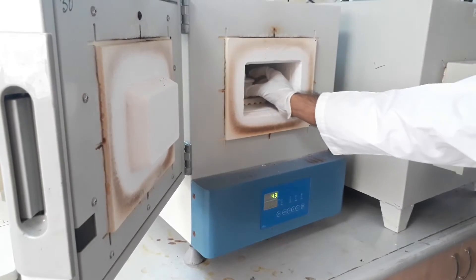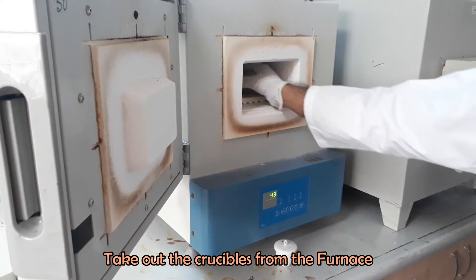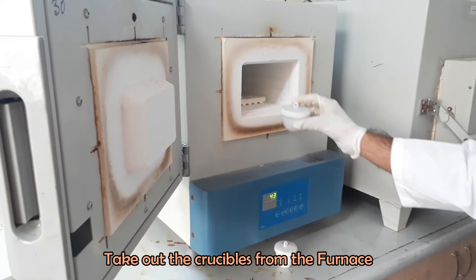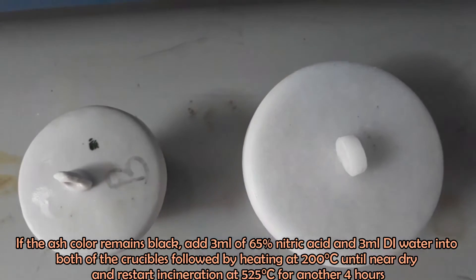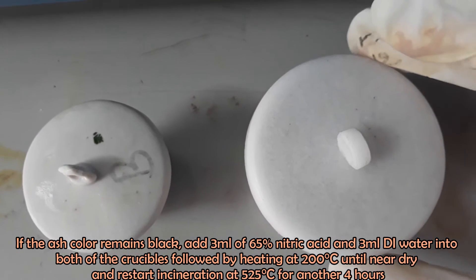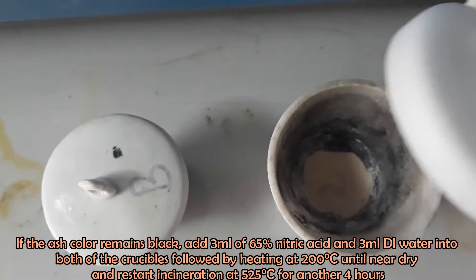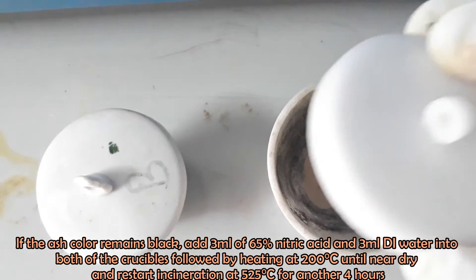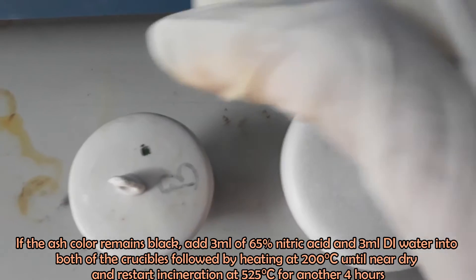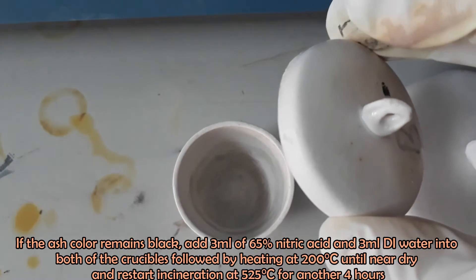After incineration, take out the crucibles from the furnace. If the ash color remains black, add 3 ml of 65% nitric acid and 3 ml deionized water into both of the crucibles followed by heating at 200 degrees Celsius until near dry. And restart incineration at 525 degrees Celsius for another 4 hours.